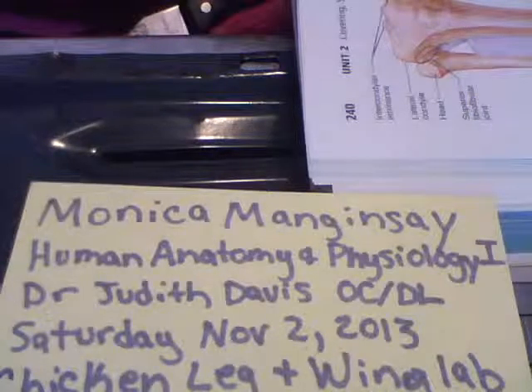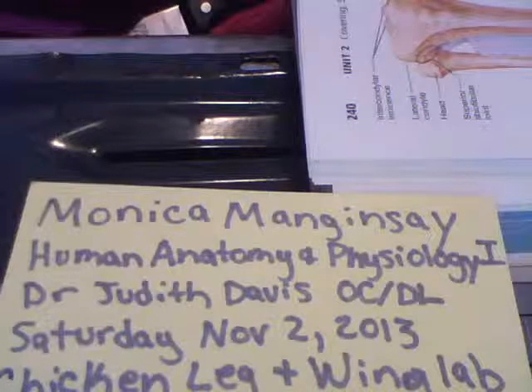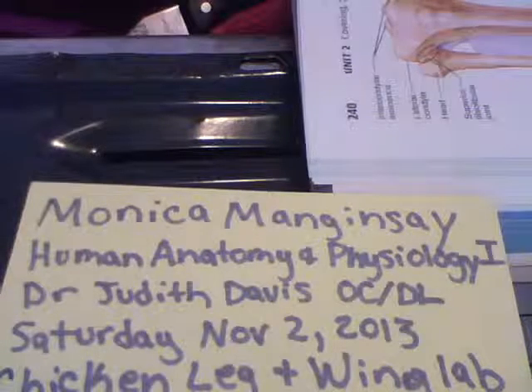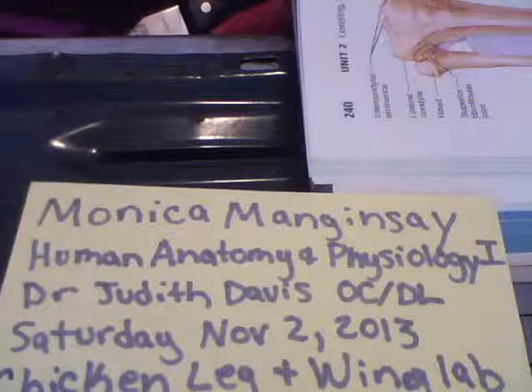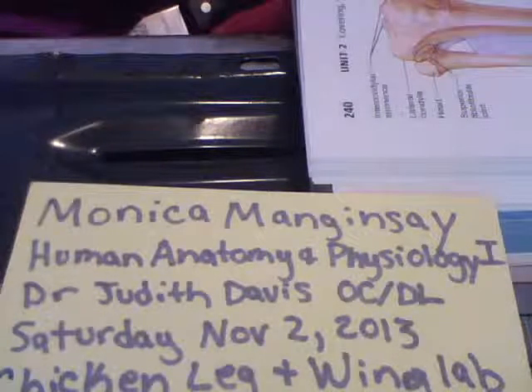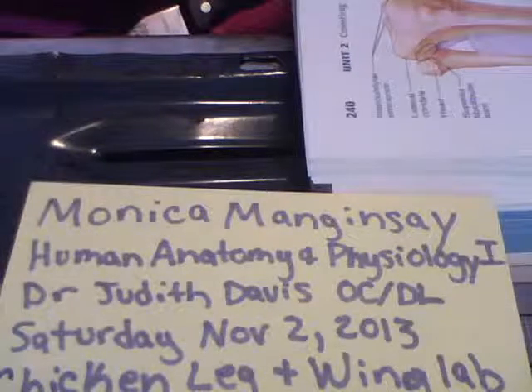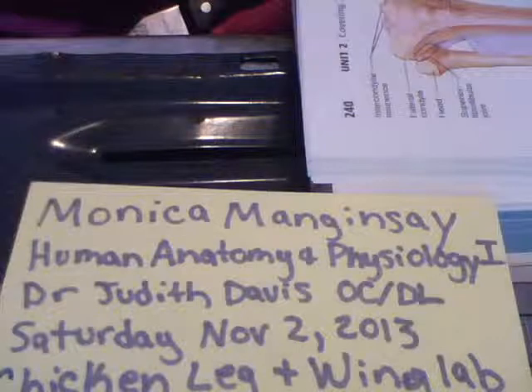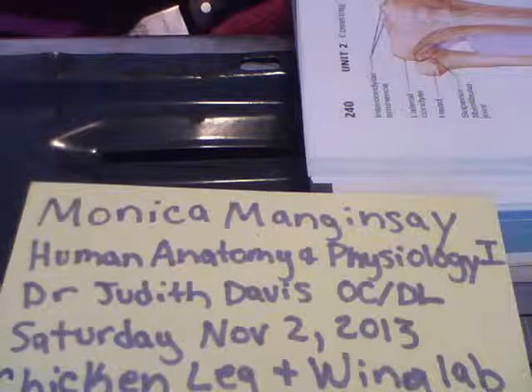Distally, the tibia is flat, where it articulates with the talus bone of the foot. Medial to that joint surface is an inferior projection, the medial malleolus, or little hammer, which forms the medial bulge of the ankle. The fibular notch on the lateral surface of the tibia participates in the inferior tibiofibular joint.